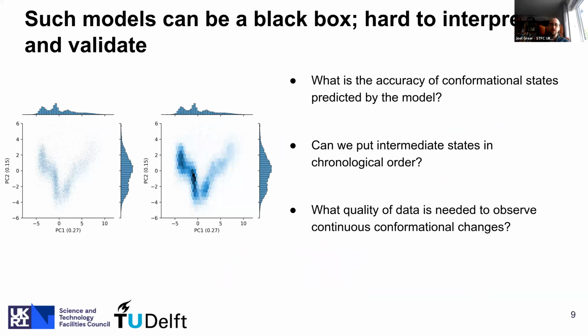Okay, so we've got these heterogeneous reconstruction algorithms that we'd like to use, but how do we know that these methods are actually functioning as we expect them to? Are the latent space representations of heterogeneity organized in some kind of sensible or interpretable way? We know that the latent space representations are inherently nonlinear, which can make them challenging to interpret.